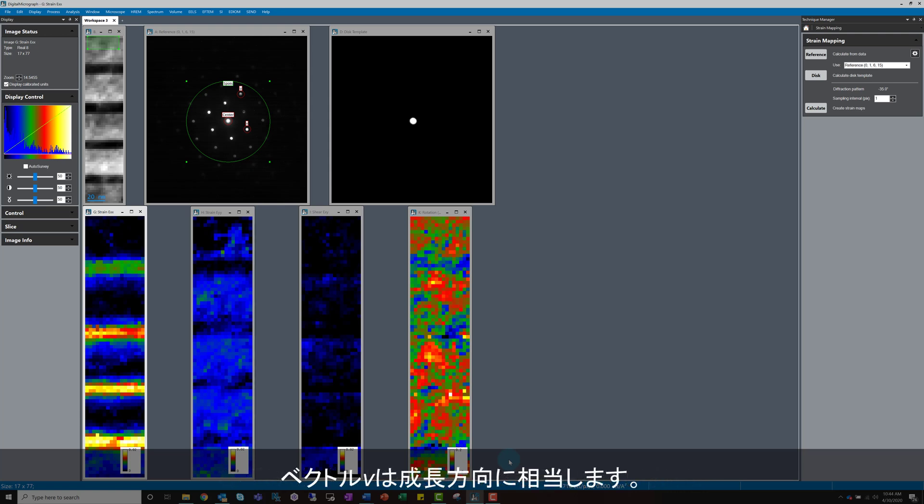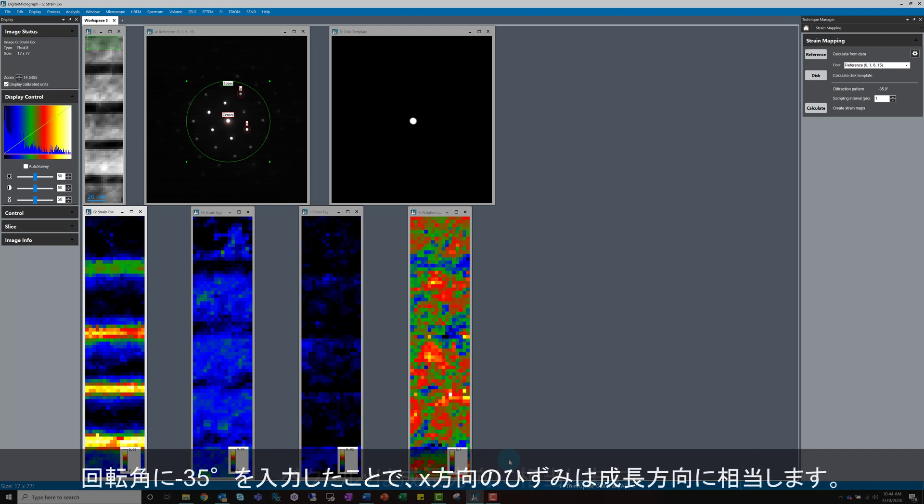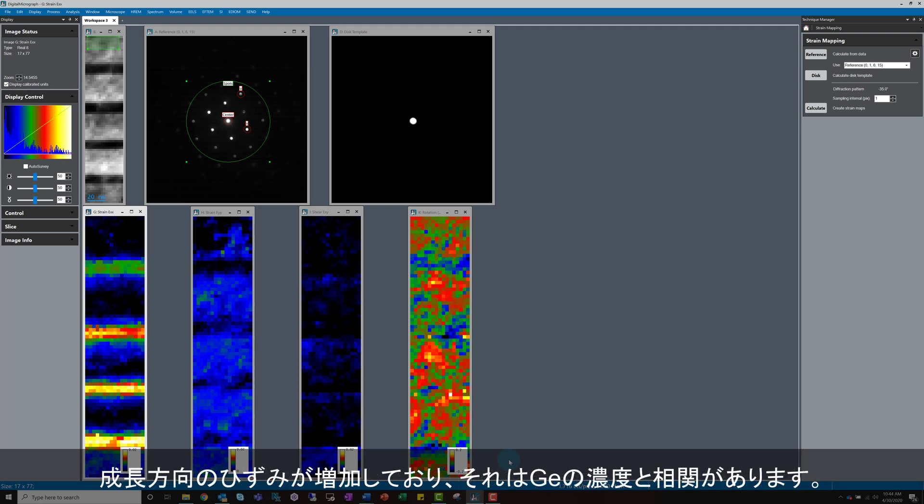During the setup, we defined vector V as being in the growth direction of the sample. A minus 35 degree rotation was applied, so the strain in the X direction of the diffraction pattern corresponds to the strain in the growth direction. As expected, the strain in the growth direction increases. The germanium concentration is increasing in this direction, which would increase the strain, so the result makes sense.